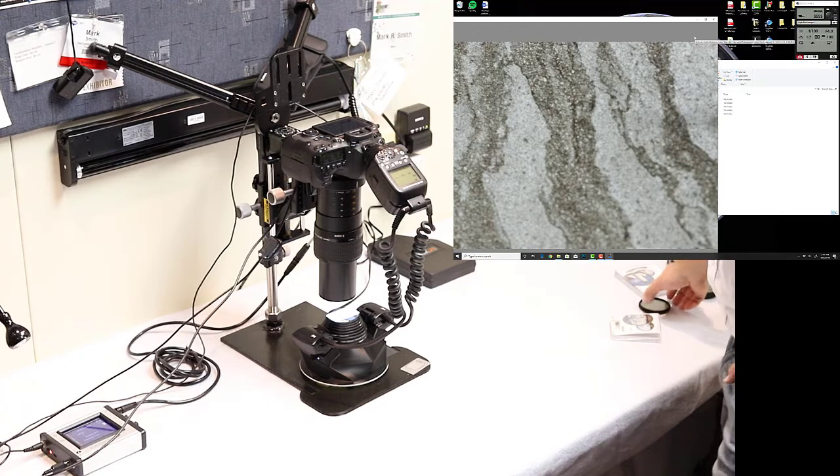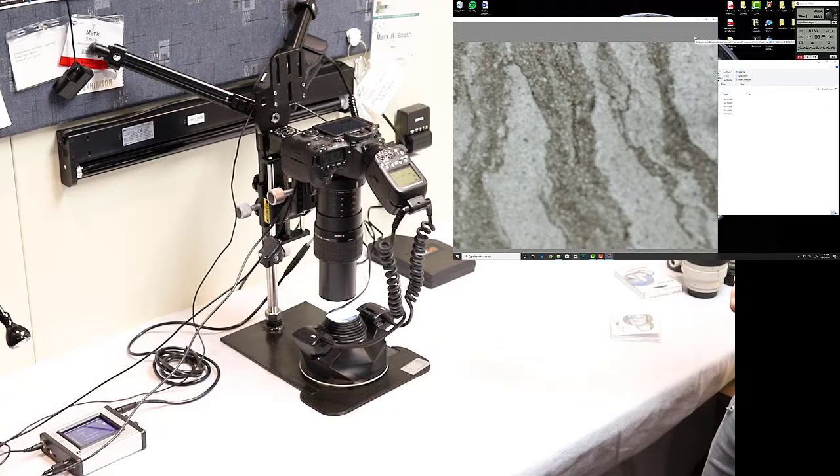One other thing that's interesting is that if you're using a petrographic microscope, a 1x magnification on our system is going to be equivalent to a 10x optic on any petrographic microscope. So that's going to give you context in terms of factoring in resolution and also the 10x eyepiece, which does not exist on the camera but does exist in the distance in which light has to travel into your camera sensor. The image is being enlarged tenfold.